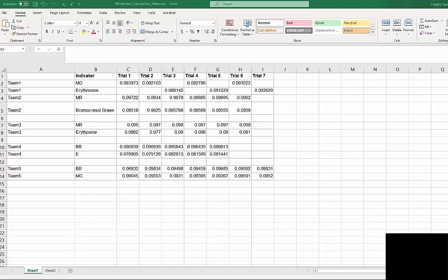Hello, this video is here to help you do the calculations for experiment number 5, analysis of an acid-base indicator, associated with Daniel Harris's Quantitative Chemical Analysis textbook, 9th edition. So we're going to start off with what we have here.